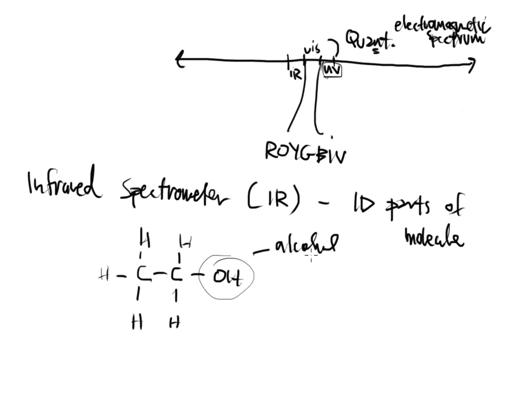Okay, so you have to imagine the infrared spectrometer as a workout routine. The molecule shows up to work out, and the molecule is going to work out a different way than all the other molecules. Each one has its own day that it likes to show up to. So for instance, alcohols love pec and shoulder day, okay?